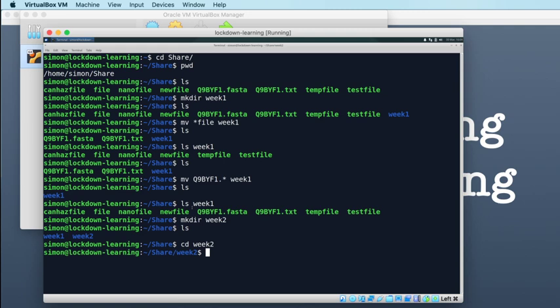So I've just spent half an hour this afternoon preparing a data set for us to download, which is just a table of, in this case, the results of some gene expression analysis. So it's the kind of results that we'll be looking at in a couple of weeks when we get that far with our own work. This is some work that I've done previously, and it's just the kind of output that you get from one of the R packages that you use to do this analysis. So it's a table of results. I've put some annotation in it so that we can read what the gene names are, and I've put that up on one of our servers so that we can all download it.